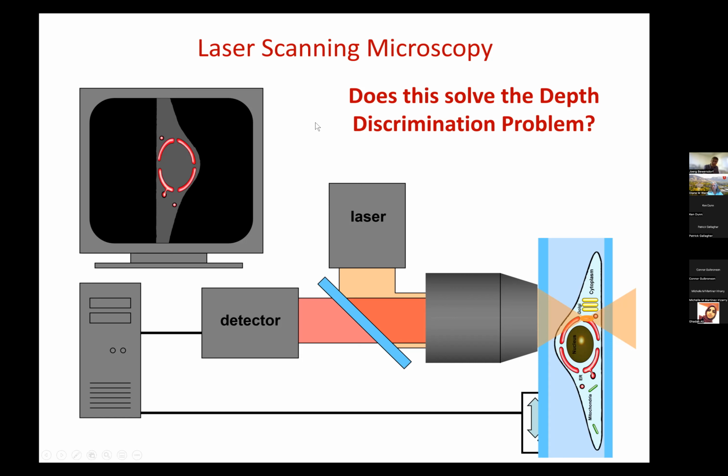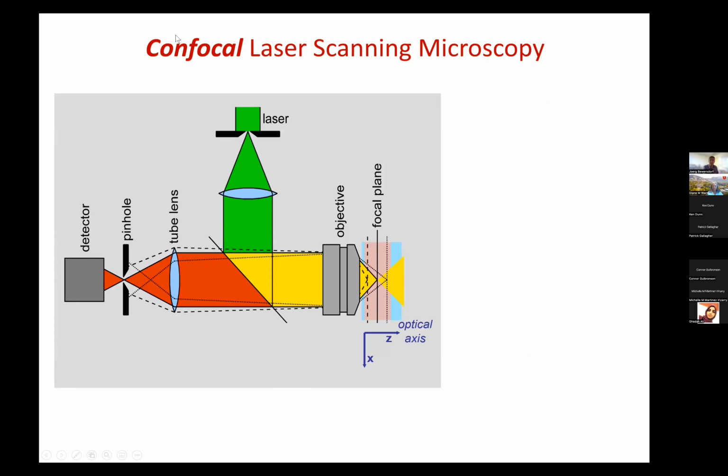So now what comes in is the fourth word here of the confocal laser scanning microscope, confocal. So we do a small modification now to this laser scanning microscope in form of a pinhole in front of the detector. And we focus the light from the focal plane here right into the middle of that pinhole and measure the light then coming through the pinhole with the detector behind it. So why does that make a difference? So let's look at what the light travels here.